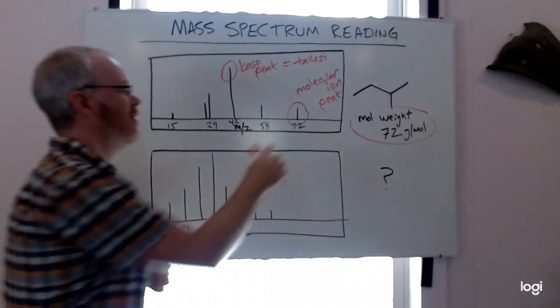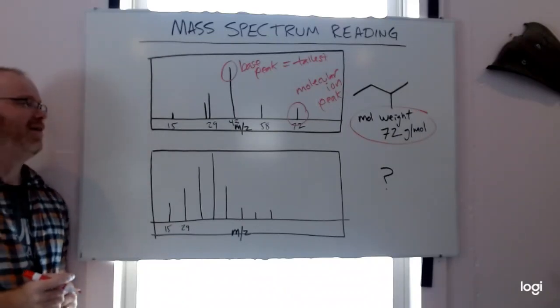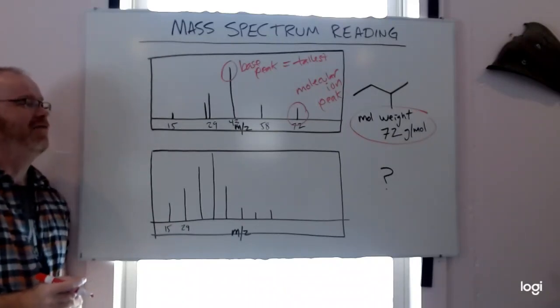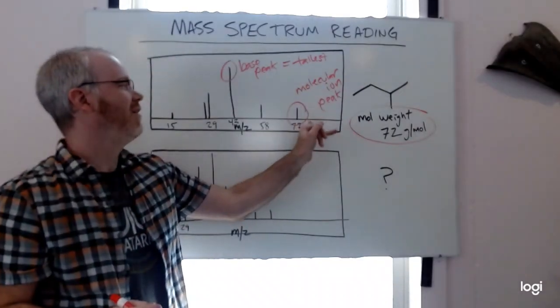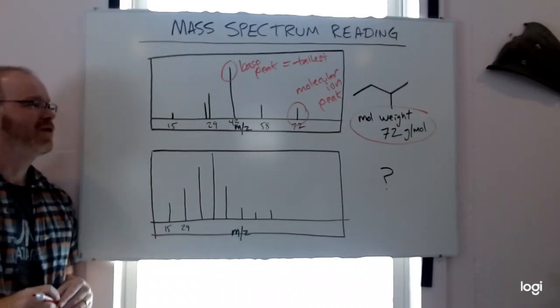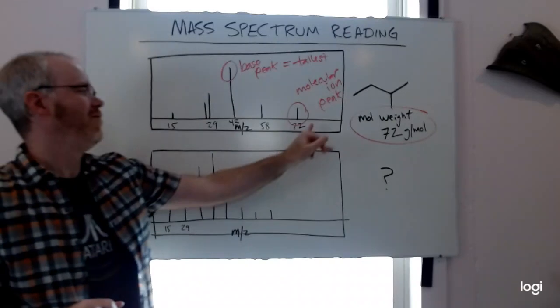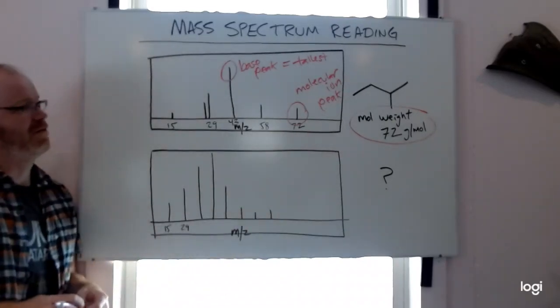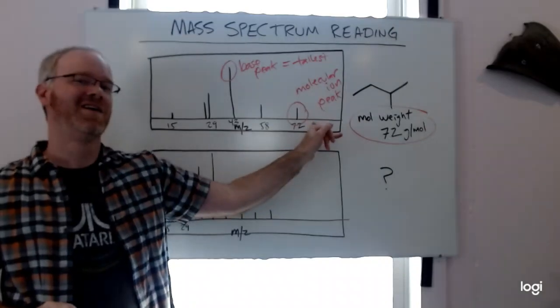And sometimes you don't see it. That's the hardest part about mass spectrometry: for a molecule that fragments easily, occasionally the molecular ion peak can be all but invisible. So a problem you won't so much run into with theoretical and textbook spectra, but a problem you will run into with real spectra sometimes, is you don't always have an obvious heaviest peak.